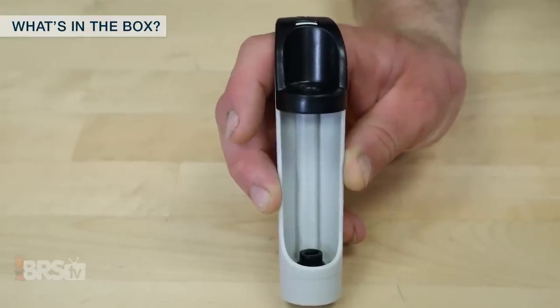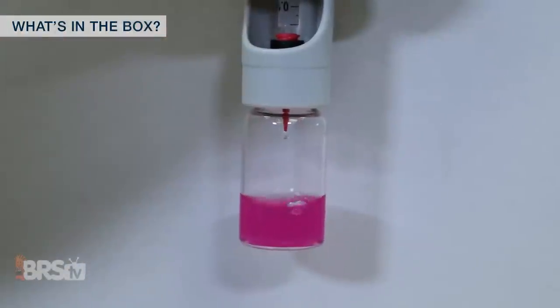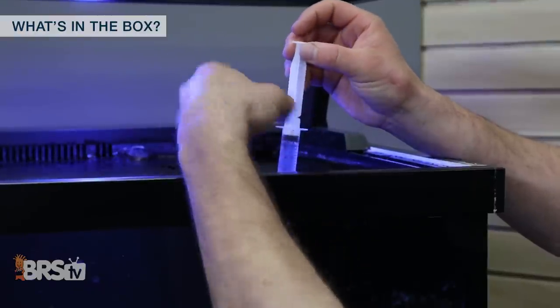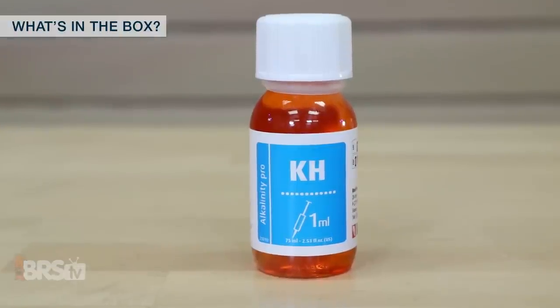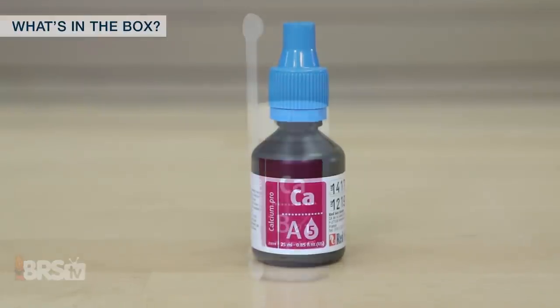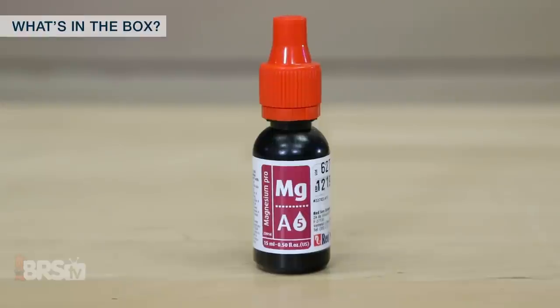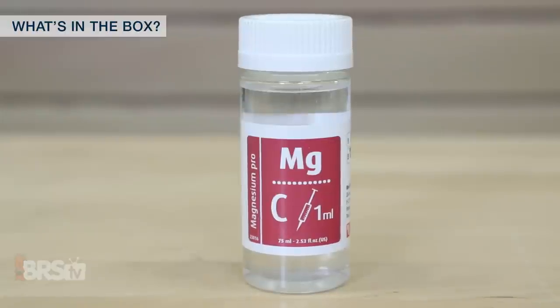One of the most useful additions to the Multi Pro test kit is the titrator itself, which allows for single-handed testing where you can add titrant solution while shaking the test vial at the same time. Red Sea also includes a 10-milliliter syringe to provide accurate and consistent water samples. The reagent and titrant solutions consist of a color-indicating solution for alkalinity, a 25-mil dropper bottle of Calcium Pro A, 20 grams of Calcium Pro B with a measuring spoon, and a 75-mil bottle of Calcium C component. The magnesium test comes with two 15-mil dropper bottles of both A and B component, as well as a 75-mil bottle of the magnesium titration solution.